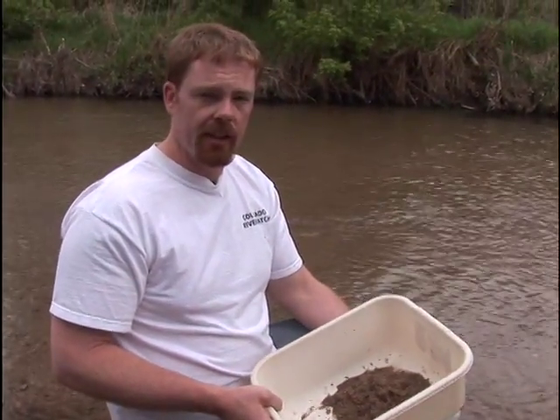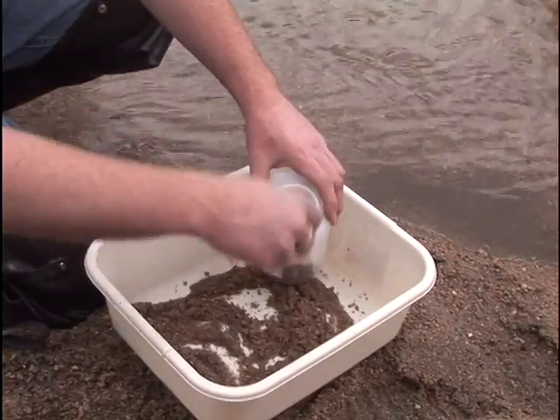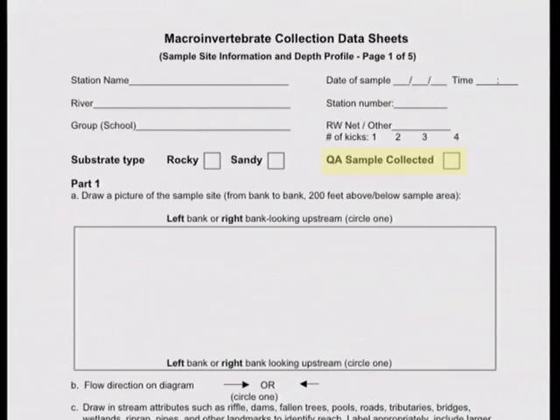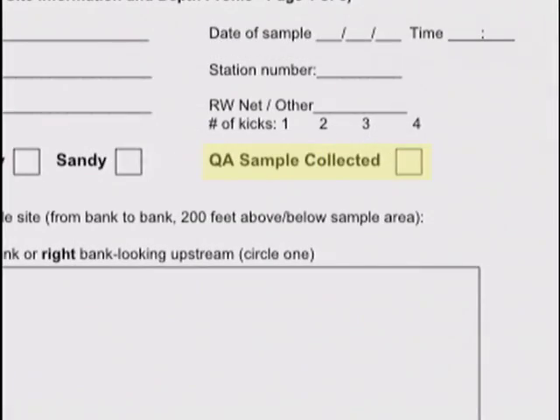If you have been selected to collect a quality assurance sample for the macroinvertebrate protocols, you need now to gather all the substrate and any discarded debris that you've collected throughout your sandy substrate collection and put it into the extra bottle that's been provided for you. We do this so that an analyst can, again, review the substrate that you've collected and make sure that the insects are not there and that you have been successful at picking all of them out of the material. Mark this area on your macroinvertebrate data sheet if you are submitting a quality assurance sample.